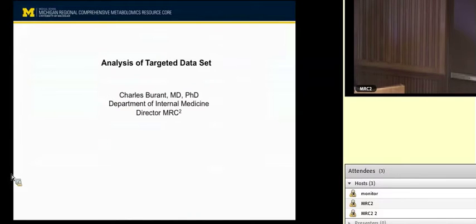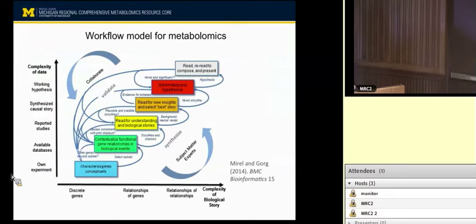All right, so I'll go through this. This is shorter, but it's kind of interesting to me. It's not the designated figure that Ala wanted us to show, but this is my concept of workflow models for metabolomics. Basically, we have to use everything that there is available to us.